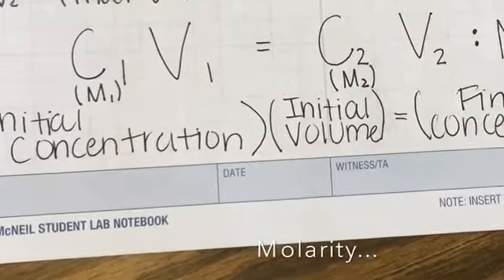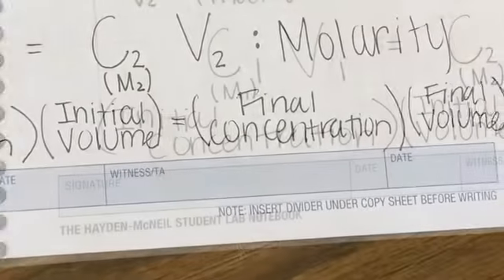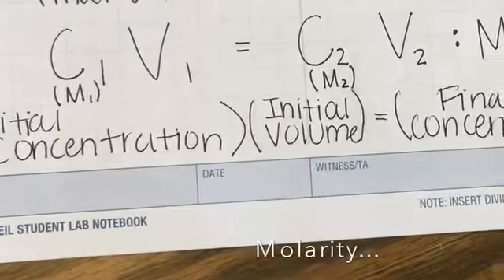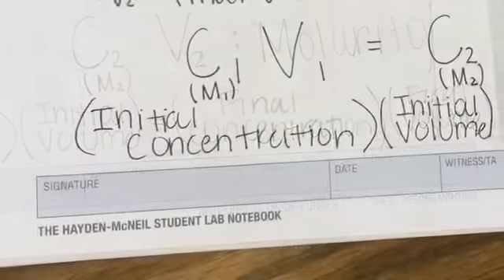Your stock solution is the substance that you're working with, or essentially the substance that you're wishing to dilute. One way that you can take this is you have your lowest volume, V1, and your highest concentration, C1, of the stock solution on the initial side.